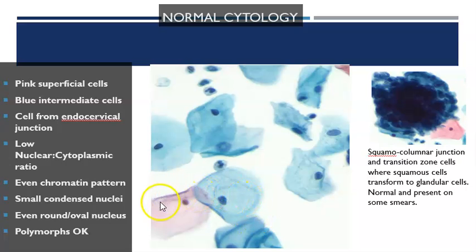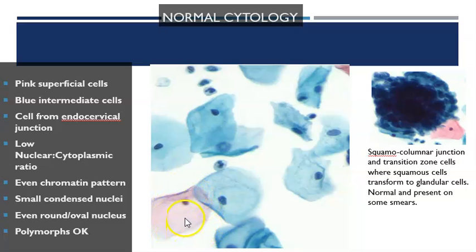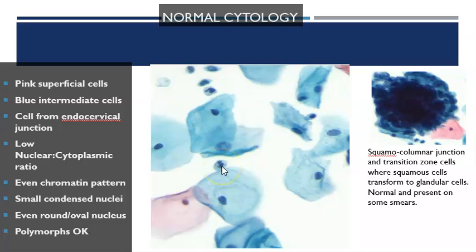This is normal cytology. We've got pink superficial cells — the very surface cells which are expressing keratin, stained up in this pink colour. We've got blue intermediate cells which have gained squamous morphology but are not expressing the keratins, with a very small nucleus and very large cytoplasm — a low nuclear-to-cytoplasmic ratio. We've got a very even chromatin pattern and one cell looks very similar to the next, with a very small oval nucleus. The presence of polymorphonuclear cells and lymphocytes is perfectly normal. Over here we've got a cluster of squamous columnar junction cells from that transitional zone, which can look quite alarming like a cluster of tumour cells but a trained cytologist would recognise them every time.